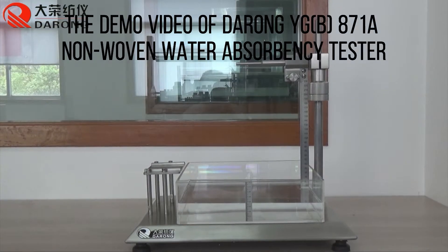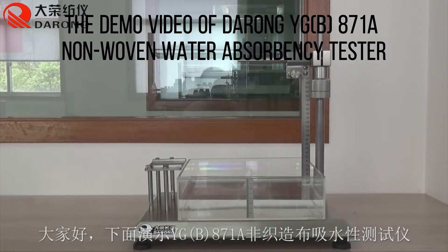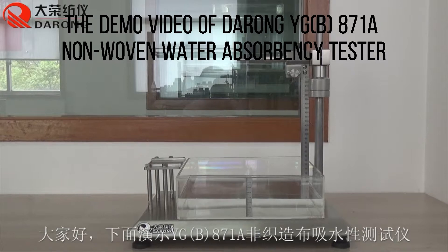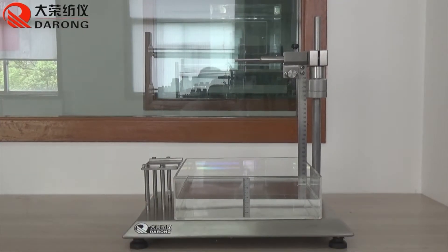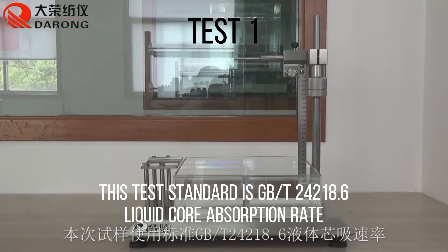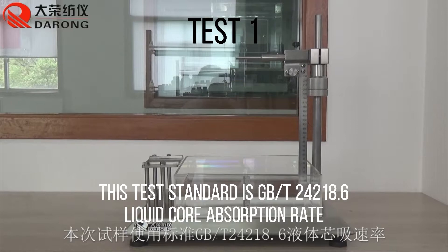This is the demo video of the YG(B)871A non-woven water absorbency tester. The test standard demonstrated is GBT-24218.6 liquid core absorption rate.